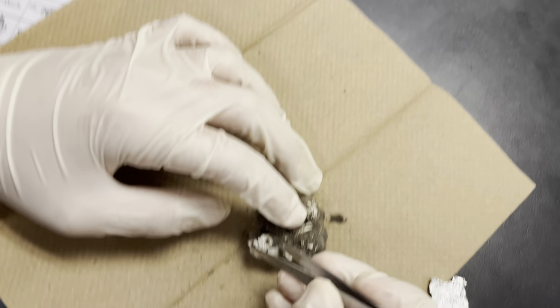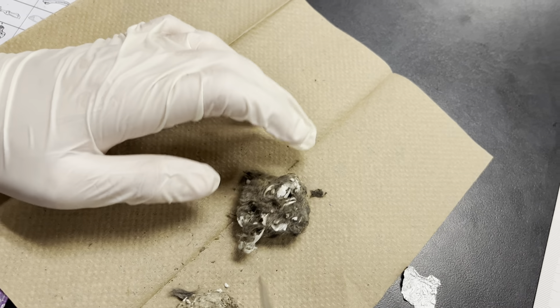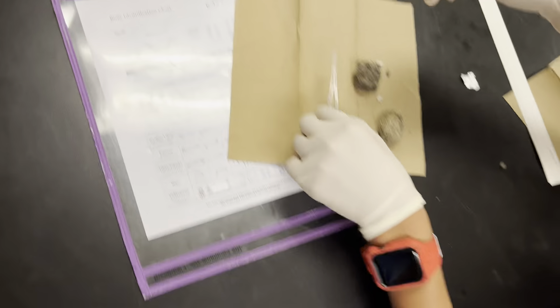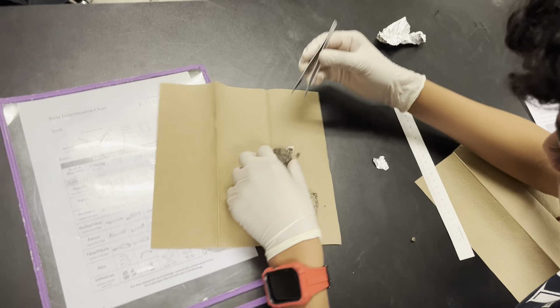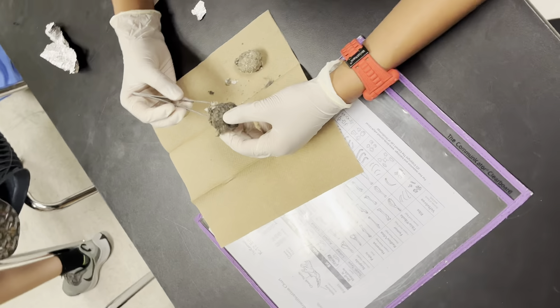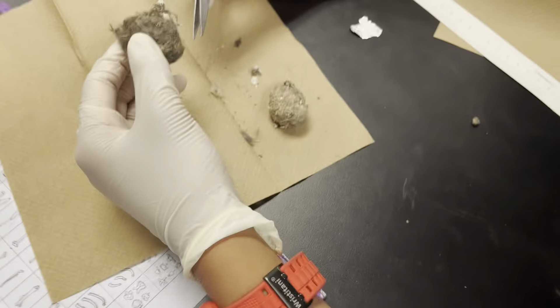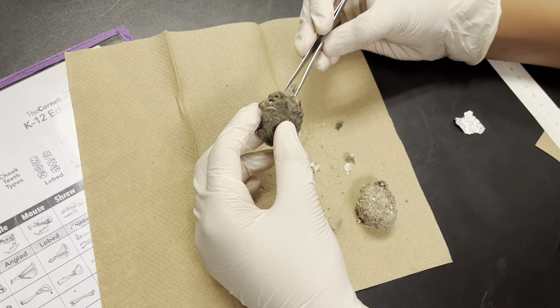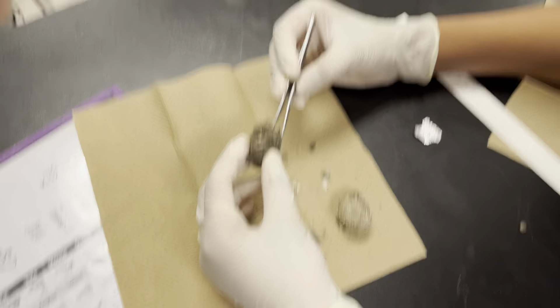We have a skull right here. Oh crap — hold the camera. The skull kind of broke. I broke a bone. I got another one — I guess I can put it like a balloon.